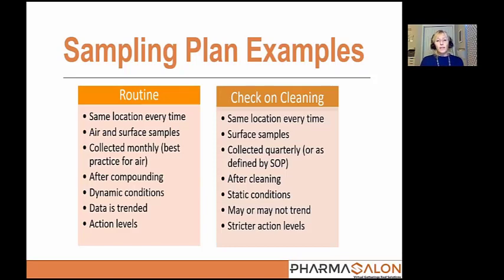But the idea here is that we don't overreact to those kinds of things, and we take it in stride with what is actually there, how many, and if it's just the one, is this the first time? Are we recovering the same organism? So we take a look at a lot of aspects there and make some really good decisions based on what the data is telling us. So I think some of that information I'll probably cover a little bit later in the presentation.